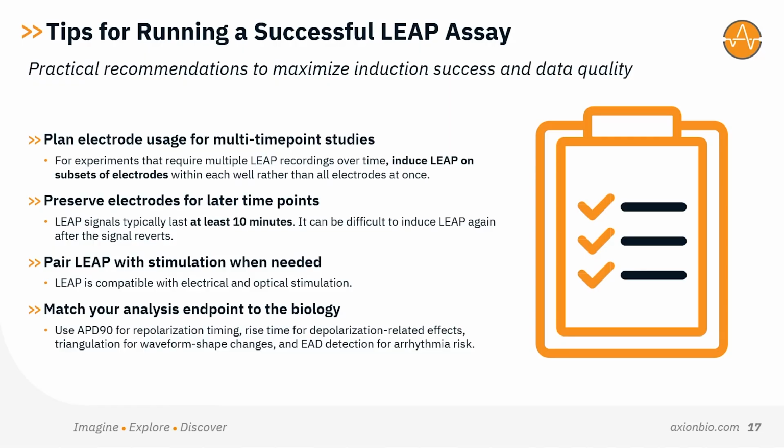Finally, we need to match the analysis endpoint to the biology. APD90 is useful for repolarization timing. Rise time can help evaluate depolarization-related effects. Triangulation captures waveform shape changes. And EAD detection supports arrhythmia risk assessment.